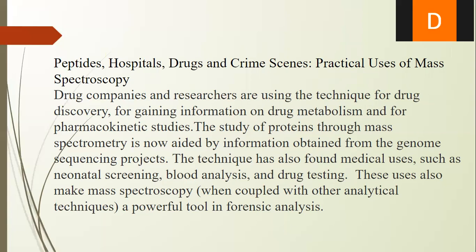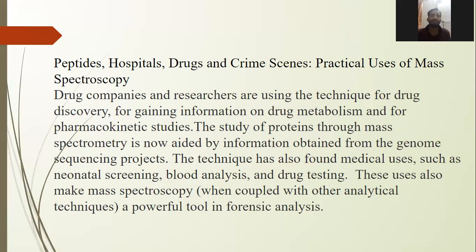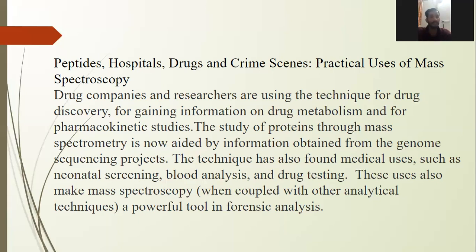Question: Where can we use mass spectrometry? There are many specific applications of mass spectrometry, including drug testing and discovery, food contamination detection, pesticide residue analysis, isotope ratio determination, protein identification, and carbon dating.